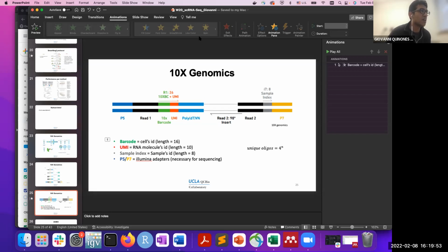They summarized it really well in the answer, so thanks for that, Qingwen. When you have paired-end reads, usually one read will be forward, in the same direction as the RNA molecule, and the other will be reverse.